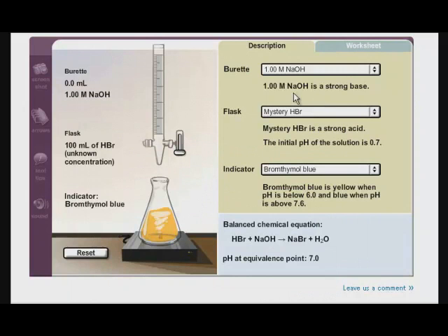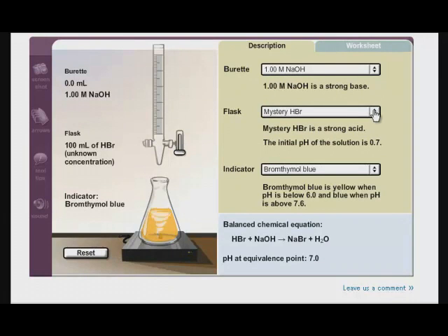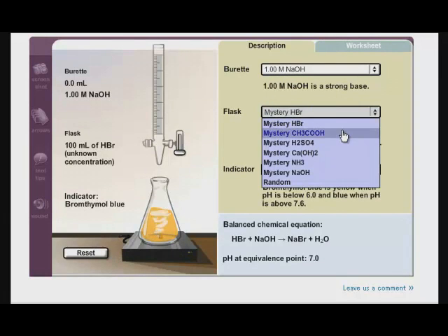In this gizmo, you titrate something of a known concentration against something of an unknown concentration. You have the ability to change not only the concentration, but also the analyte of the substance that's in the burette, the titrant, as well as your analyte.